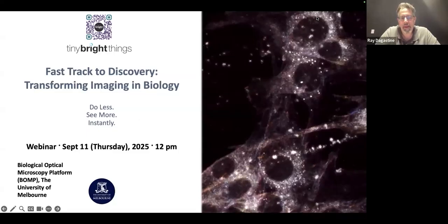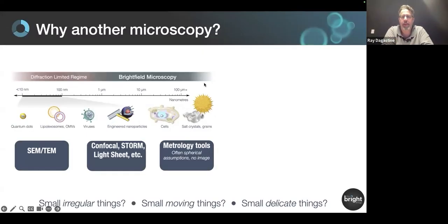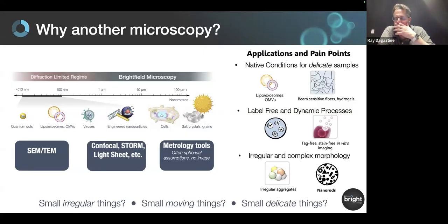So when you look at imaging, you kind of go, do you really need another microscopy method? I mean, you've got confocal. Light sheet's been a lot of fun. It's fast. It can do bigger things than confocal sometimes. There's lots of structured illumination. For people that do life science fluorescence or confocal imaging or histological staining, you're really good at it. You've got set up workflows. Why change? And that can be true of other methods as well, SEM or TEM, if you're trying to get an image of something. But even now, there's still challenges that will come up.